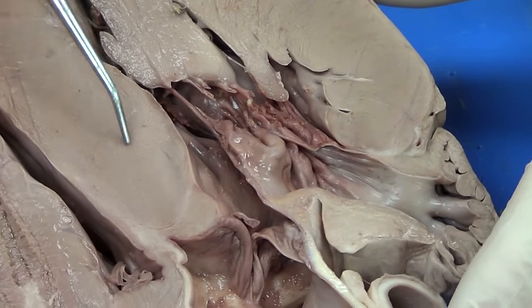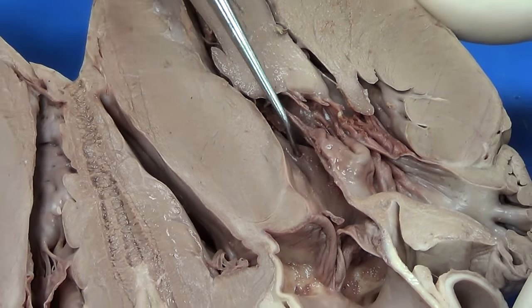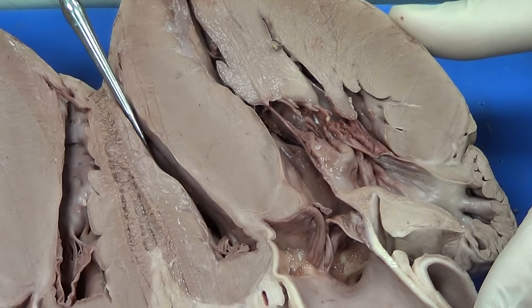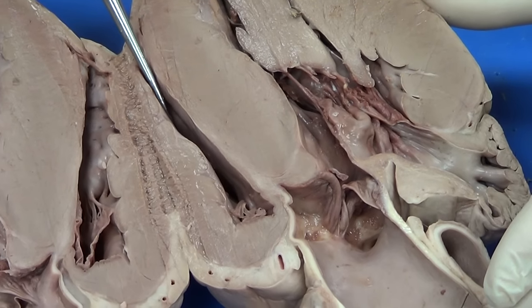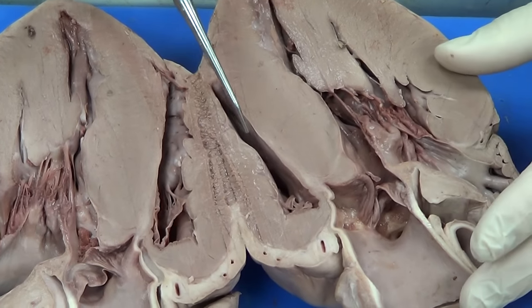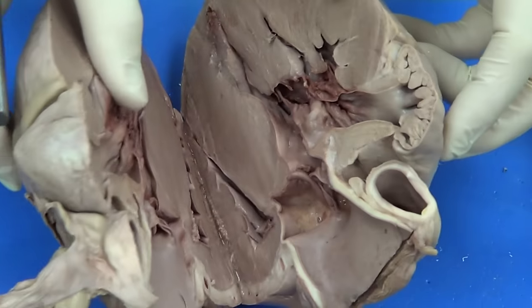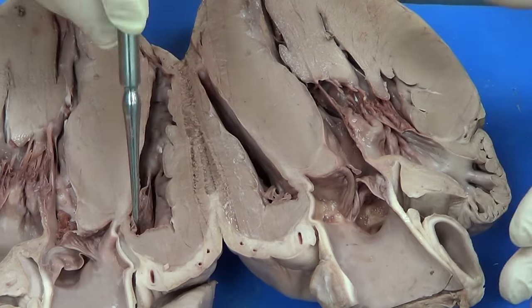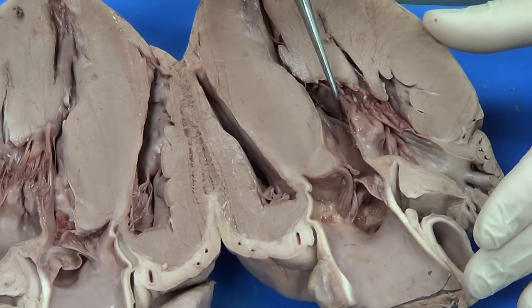Moving over here, I see another muscular structure — not quite as muscular as the left ventricle, but very muscular. This is going to be another ventricle, and this is going to be called the right ventricle. If we superimpose the heart and close it back up, you can see that this is also the right ventricle — I simply cut right through the right ventricle. And the same thing goes for the left ventricle on this side.